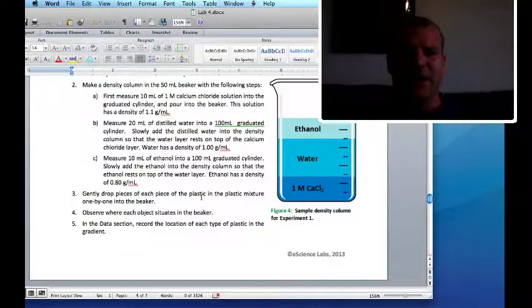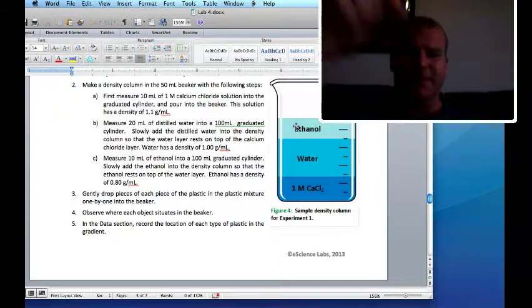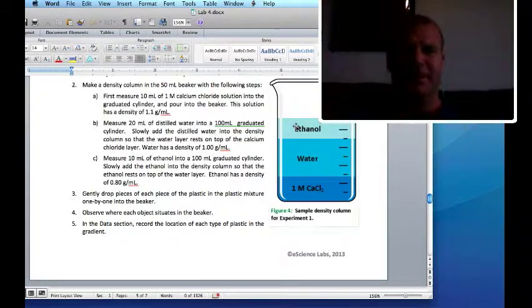Little hint, don't let any air bubble get trapped underneath that, because if you get air bubbles, they're going to float on top of the ethanol. So you might have to take your stirring rod and poke them a little bit if air gets trapped under there. If it's floating on top of ethanol, poke it a little bit, and if you keep on doing that and nothing happens, then it's going to be lighter than ethanol, or less dense. I'm sorry, I should say less dense.